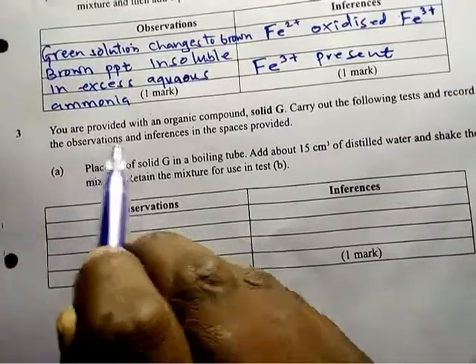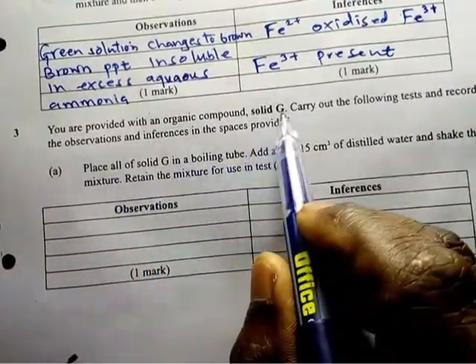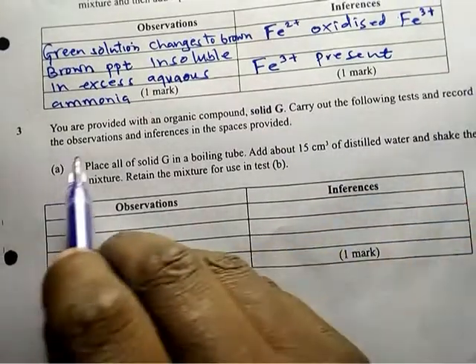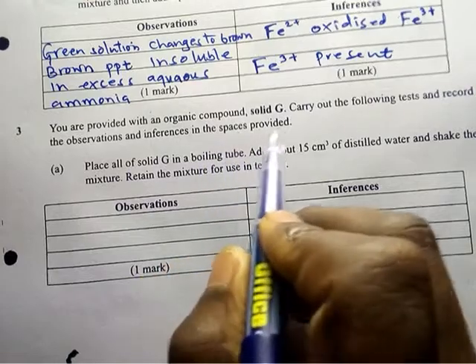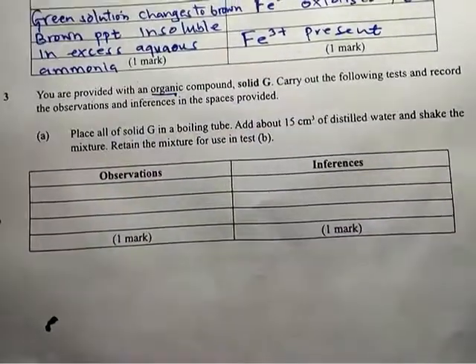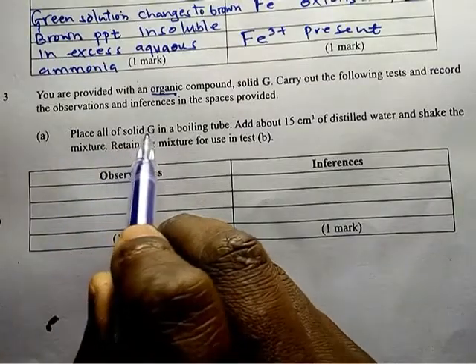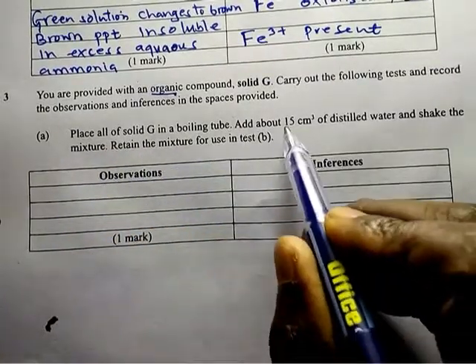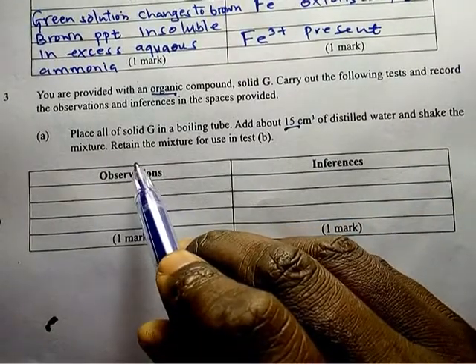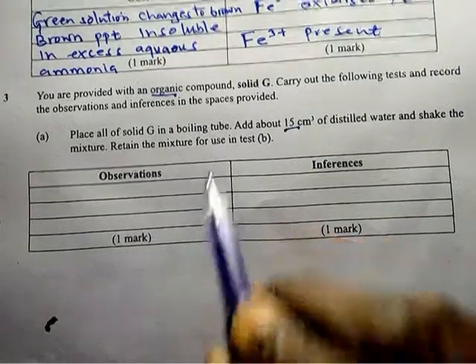You are provided with an organic compound, solid G. Carry out the following tests and record the observations and inferences in the spaces provided. So you have been told it is an organic compound. Place all of solid G in a boiling tube. Add 15 centimeters cube of distilled water and shake the mixture. Retain the mixture for use in B.